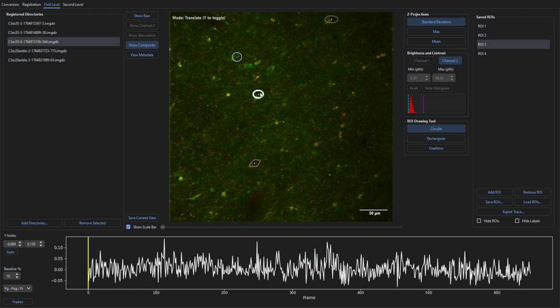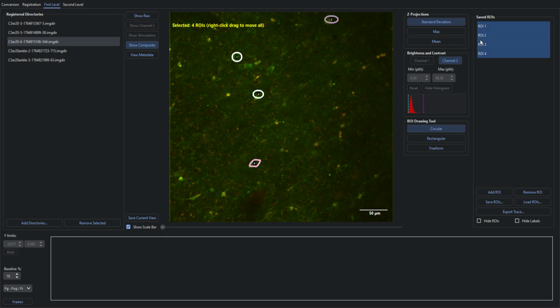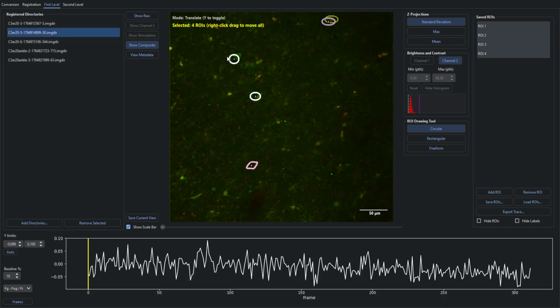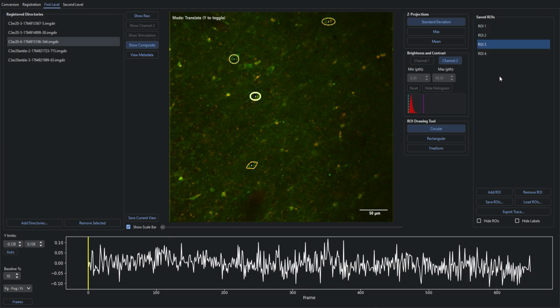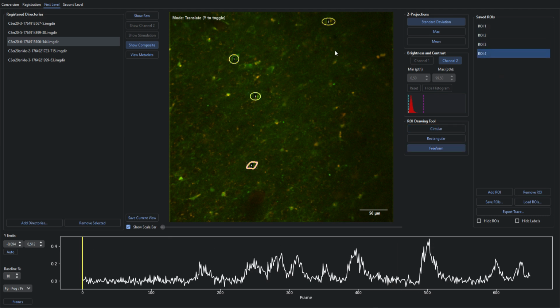And what I would do is I would select all of them. So just go here, save ROIs, and Control A. And I would move them a bit, like maybe here, right? And then press R. There. And now you save these ROIs as ROIs position sample 2, right? So they're the same, right? This is also 1, 2, 3, 4, but it's just slightly translated so that you can get the most accurate sort of a recording here.